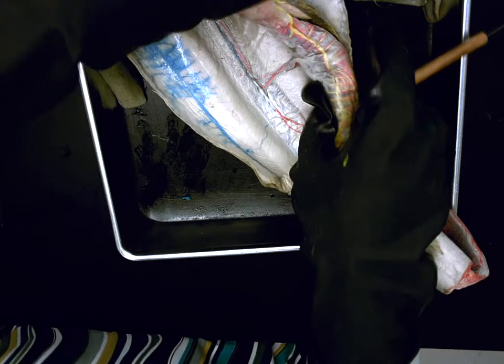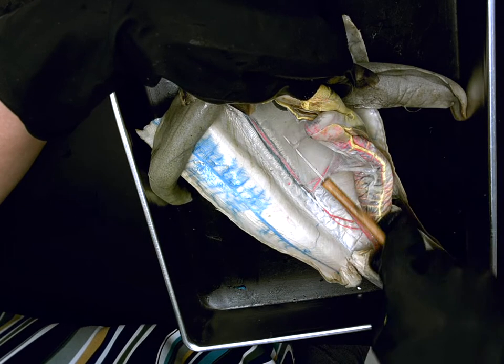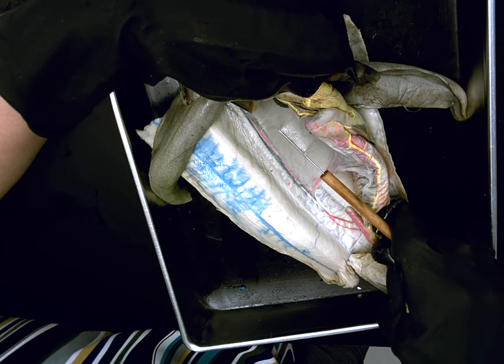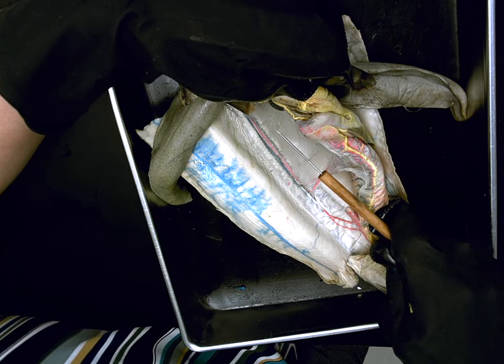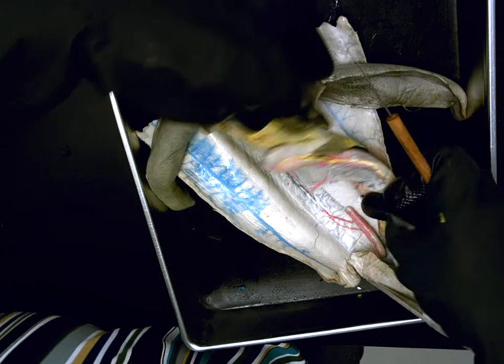All right, then we have this one, you guys. See this nice shiny stuff here? The name of this would be, Joe? Mesenteries. Function. Holds everything in place. Holds all the organs in. Excellent. Holds all the organs in place.